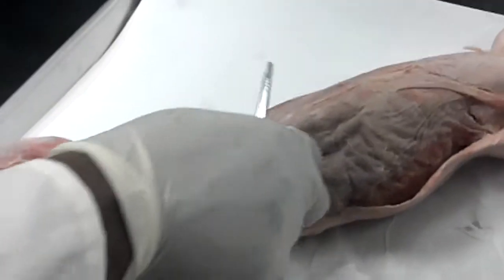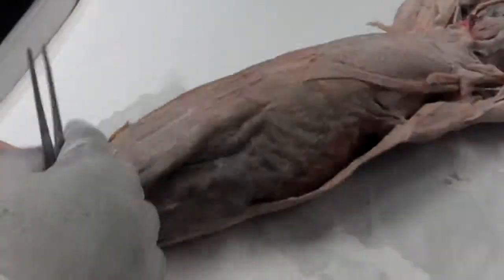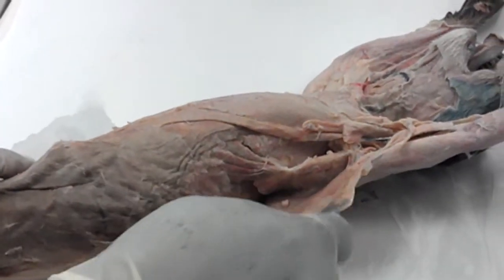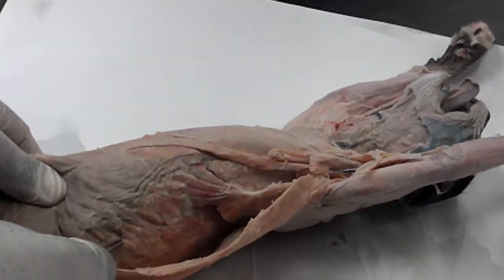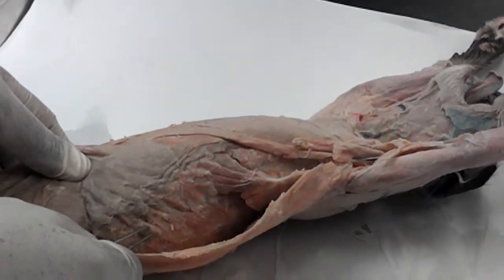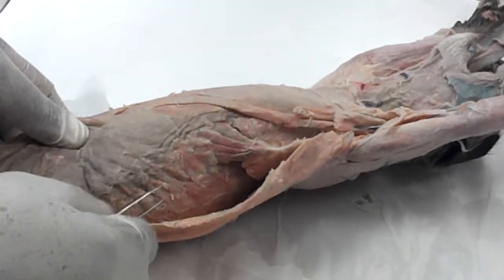Now, if we move up a little bit, I think we talked about everything over here. If we reflect the latissimus dorsi, we're going to see these superficial intercostal muscles, or external intercostal muscles.